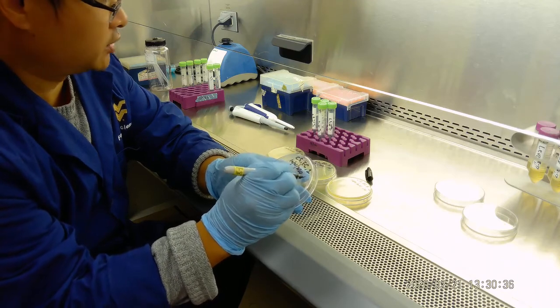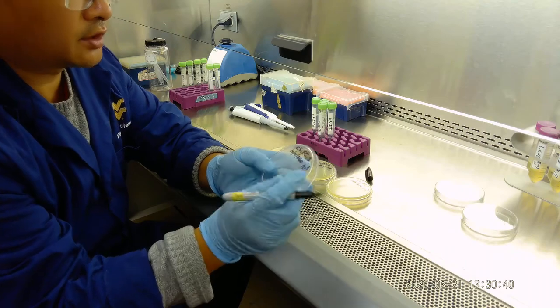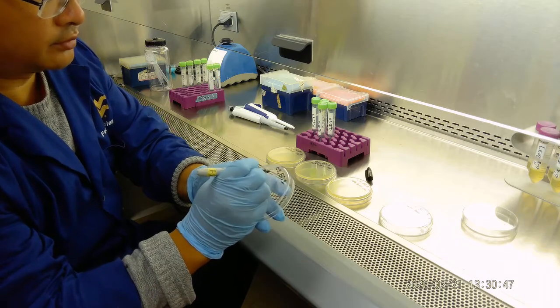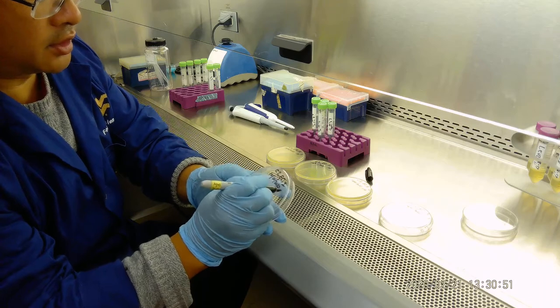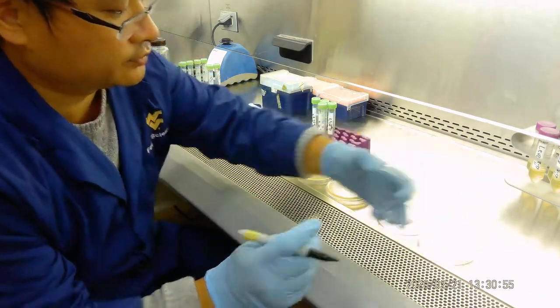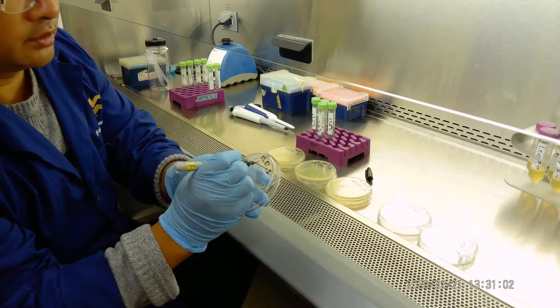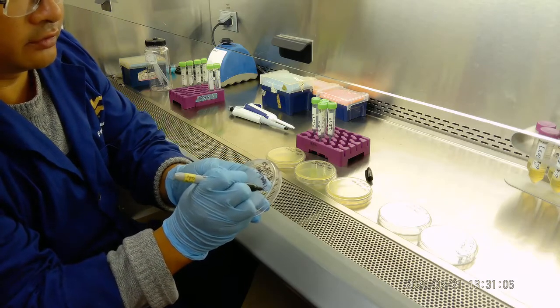We will do 10 to the 3. Okay, 10 to the 3. The second one we do CS, EC 1. We'll do 10 to the 4. And the last one we'll do CS, EC, bench number, date, and we will do 10 to the 5.